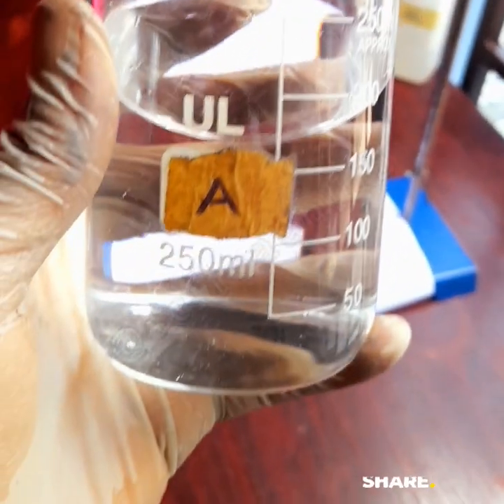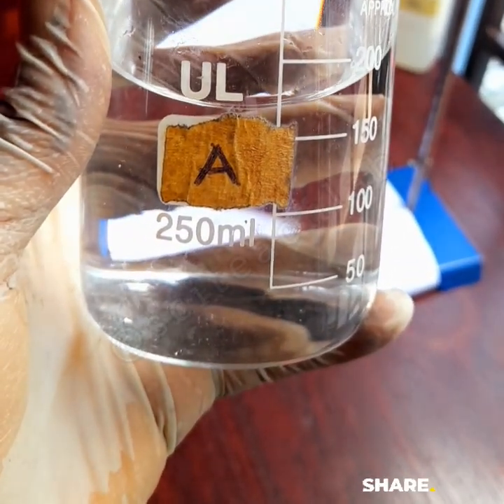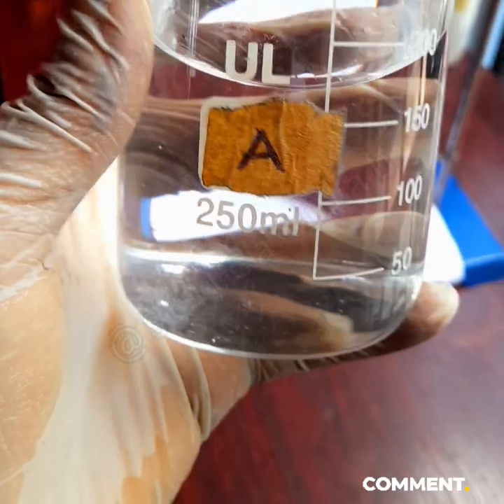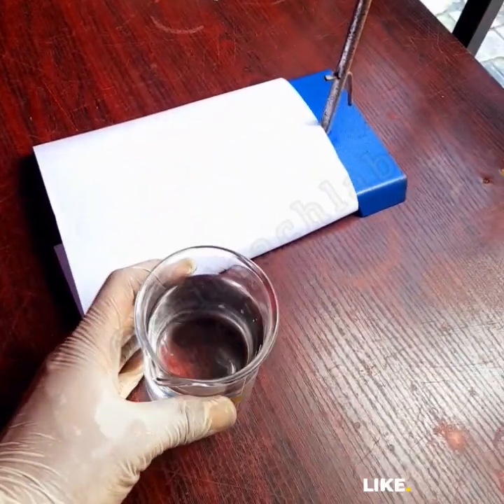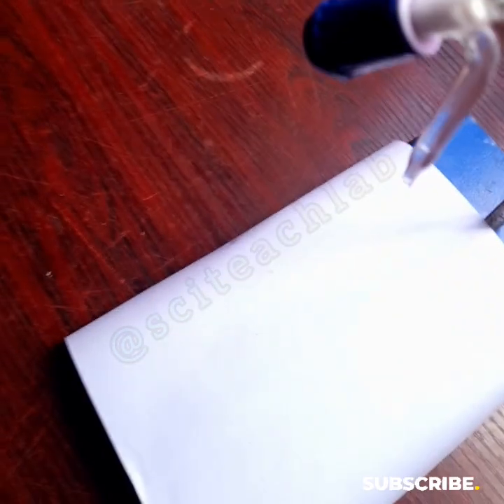So this is the process. You see, what I'm calling A is the D in the equation, because I'm calling this my acid and this is hydrochloric acid. So don't confuse yourself.